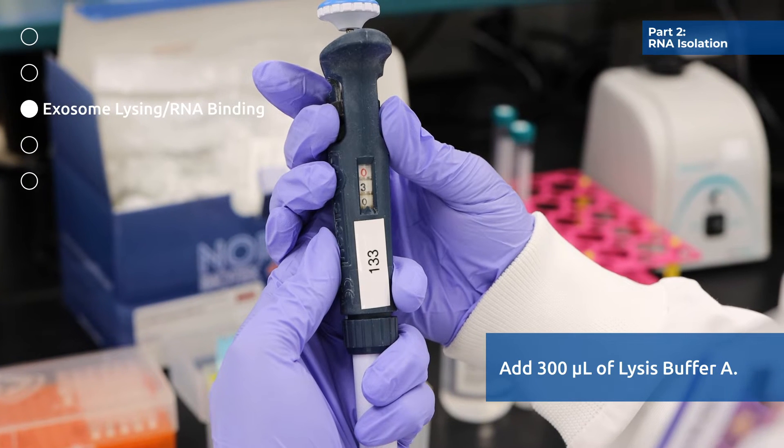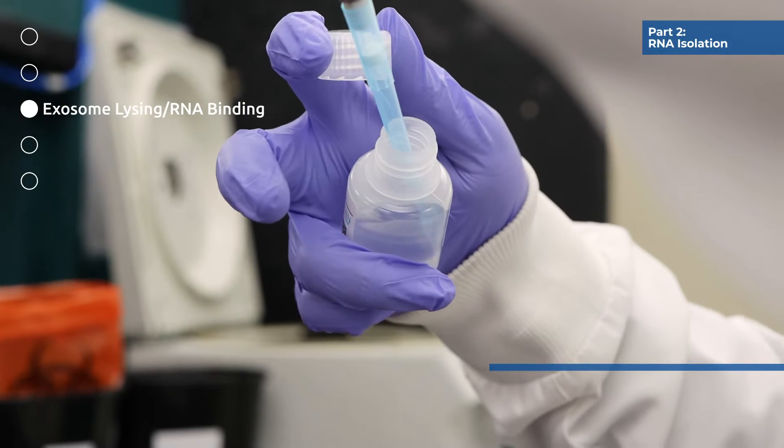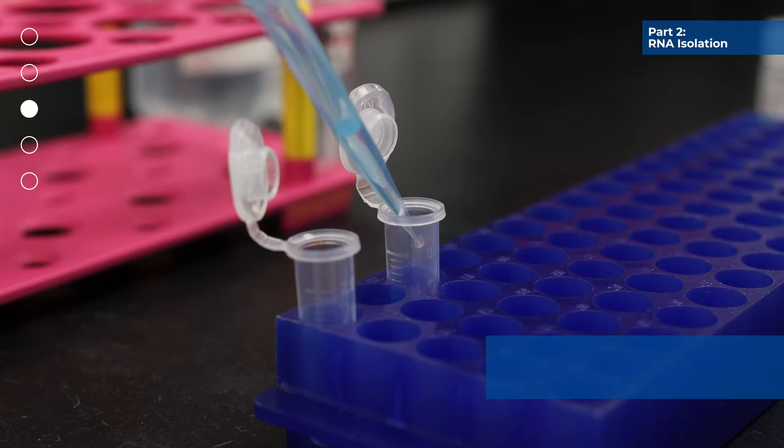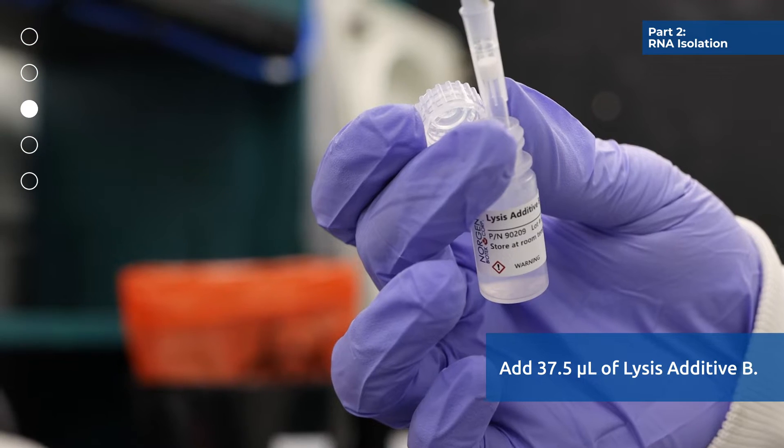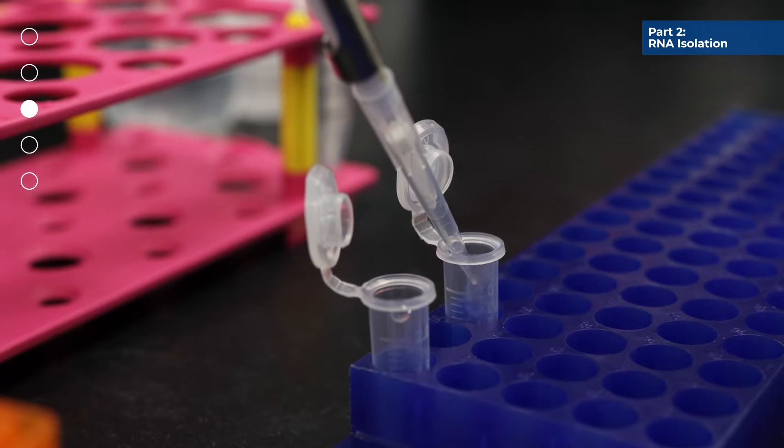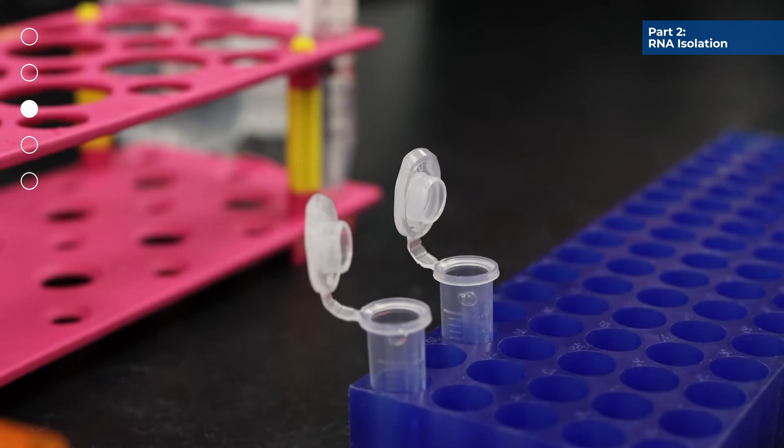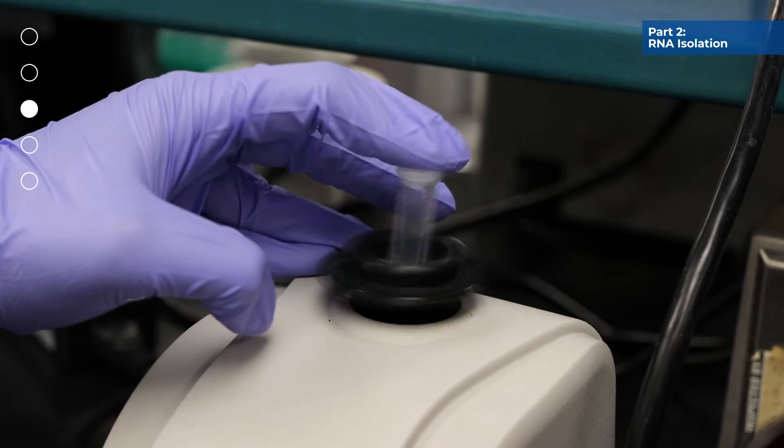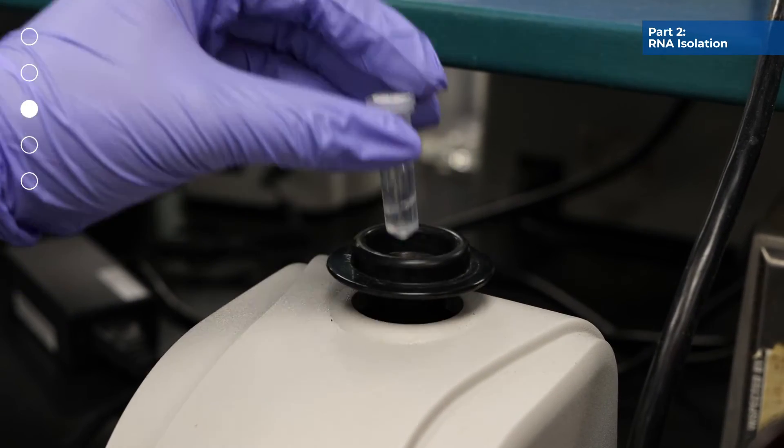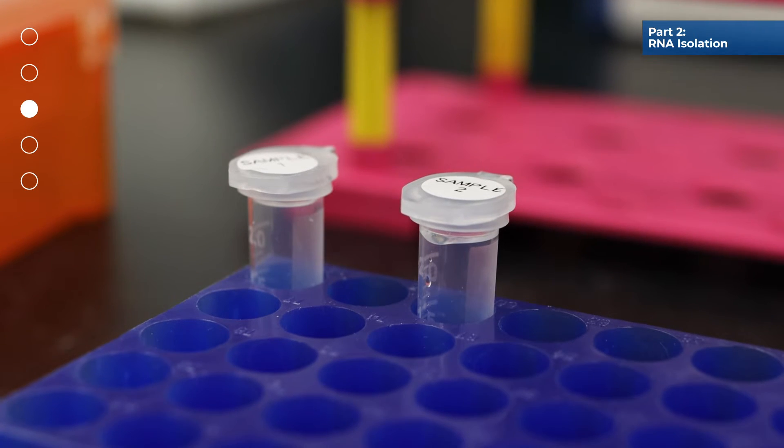Add 300 microliters of lysis buffer A and 37.5 microliters of lysis additive B to the 200 microliter exo R buffer containing the purified exosomes. Mix well by vortexing for 10 seconds. Then incubate at room temperature for 10 minutes.